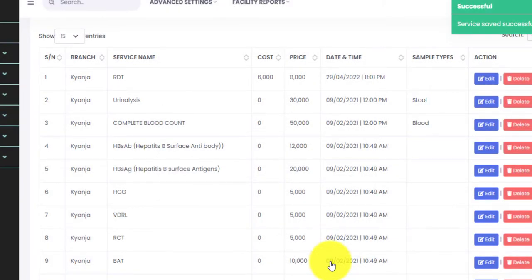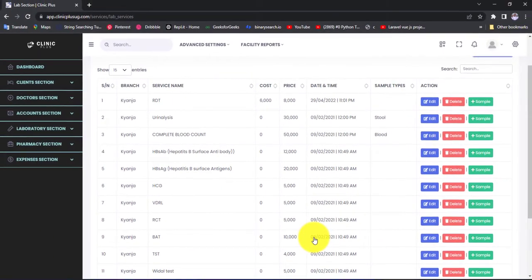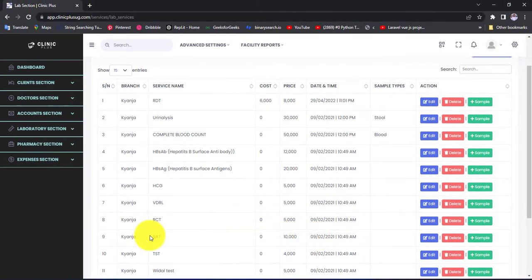We select that option and click the Save Service button. When you click that button, the service will be added into ClinicPlus software and we are going to see it listed here as the first one.